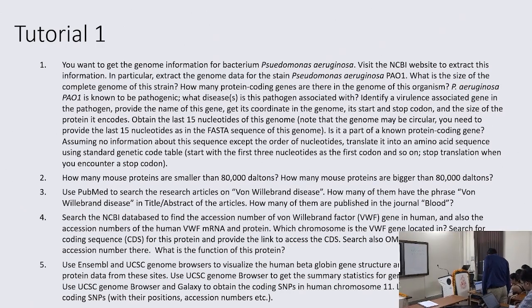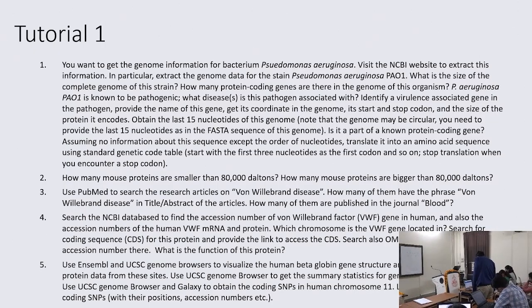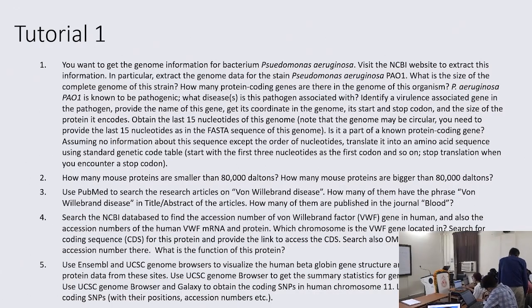Okay, how is it going? Genome, yes, Pseudomonas aeruginosa. So how is it?